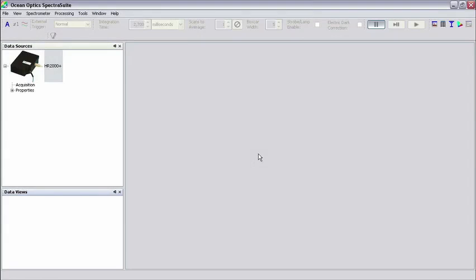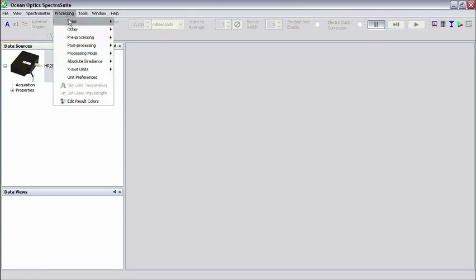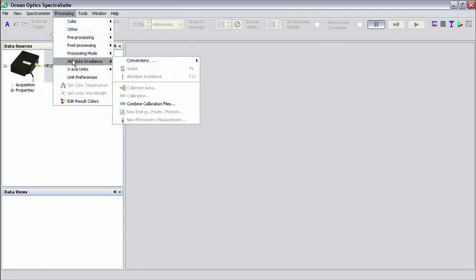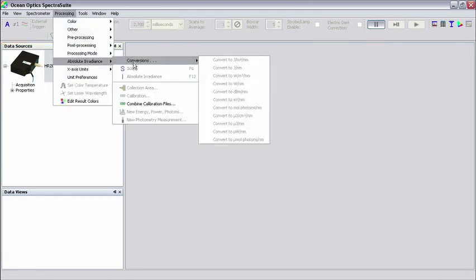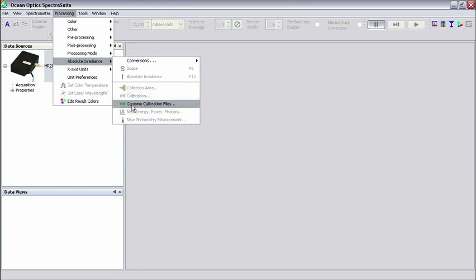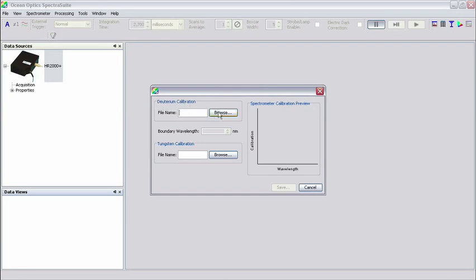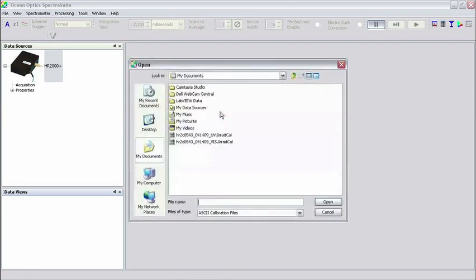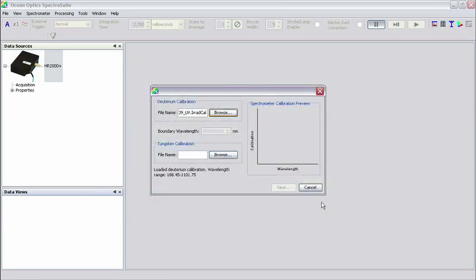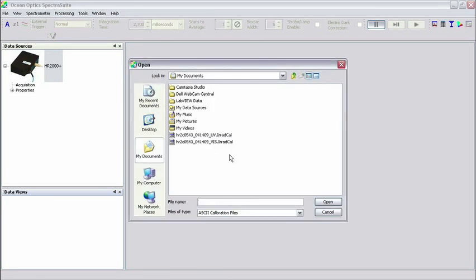Now we'll combine the UV and the VIS calibration files. To do this, click Processing, then Absolute Irradiance, then Combine Calibration Files in the menu. Under Deuterium Calibration in the next window, click the Browse button and browse to the location where your calibration files are stored. Select the UV calibration file and click Open. Under Tungsten Calibration, click the Browse button, select the VIS calibration file, and click Open.